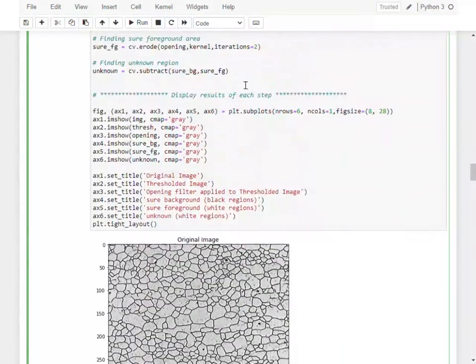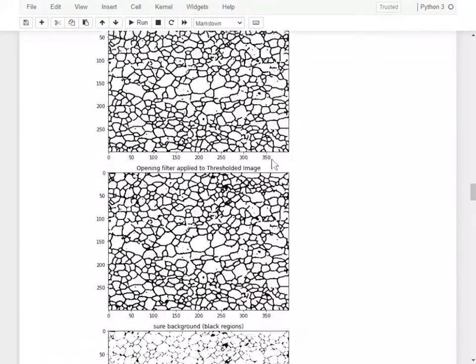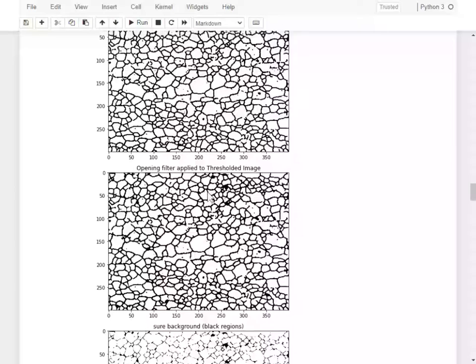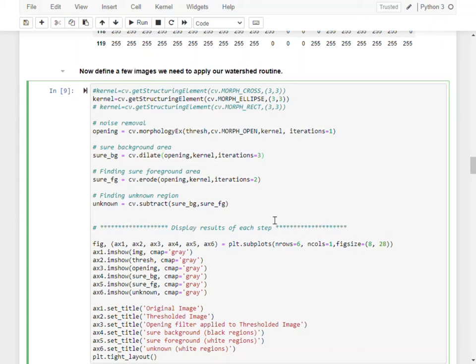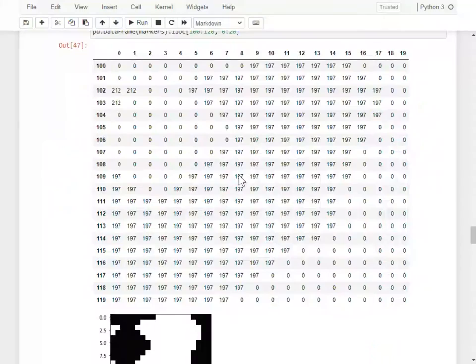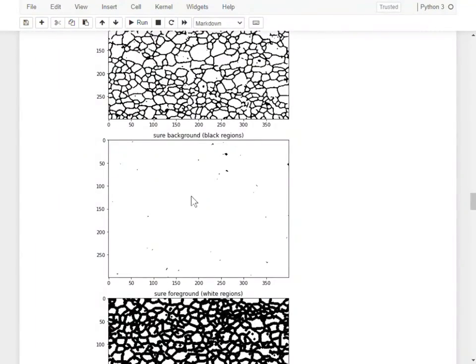So, for example, if we made this, and feel free to play with these numbers and see what happens, if I made this a 1, then if I go ahead and take a look at my background, it looks like this. Okay, and again, I don't want to specify all of this as background. I don't want it to ignore those regions. I want it to find the interface. So I'll just pick the number of iterations up to essentially where I'm just getting rid of this background altogether. All right, so this is essentially having no background.